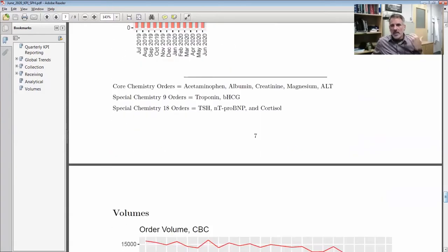But the nice thing is we have to produce this as part of our accreditation and post it on the wall, and people need to be aware of what it is. That work took someone a couple of days of futzing around in the past, and now it takes about 45 seconds. So that's an example of a static report.